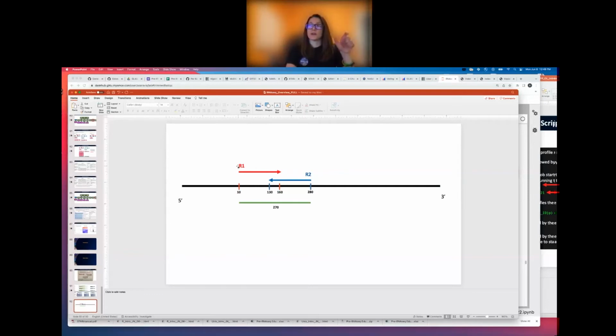So we'll see which one of those reads maps to the reference genome in the same orientation as the reference genome, and that'll be considered the forward read or the first read here, where it's going to start the template length at the leftmost position. And then if this read 1 in this case is mapping in the same orientation as the reference, then it knows that its mate, again with the same address, should be mapping in the reverse complement orientation to another place further downstream. And so it'll look for where that maps, and then at the rightmost position of where that's mapping in the reverse orientation with respect to the genome is where the end of the template length is going to be.